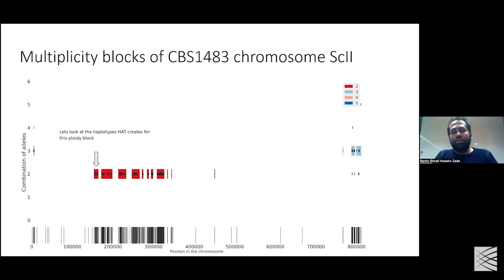And we also wanted to do some more validation for the phasing. So we took a better look at this small ploidy block that we have for chromosome 2.